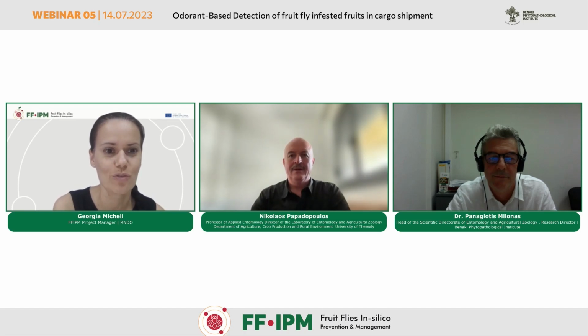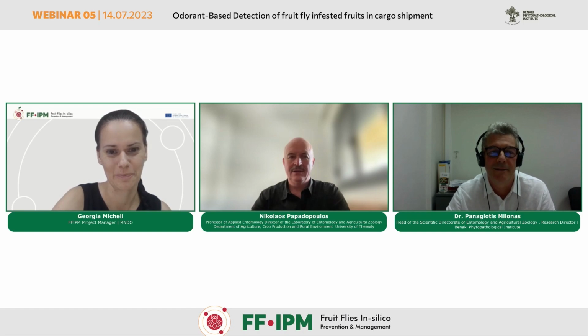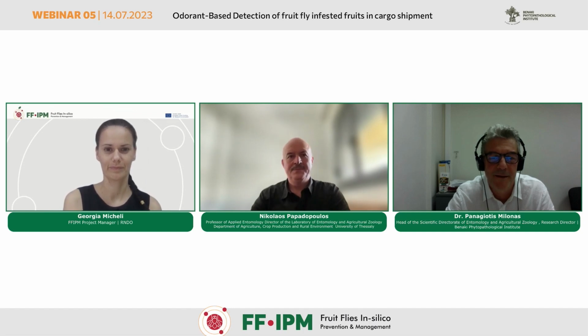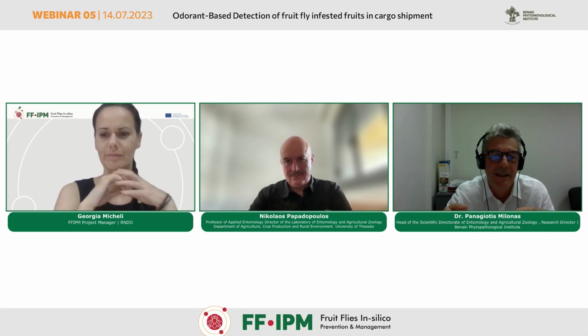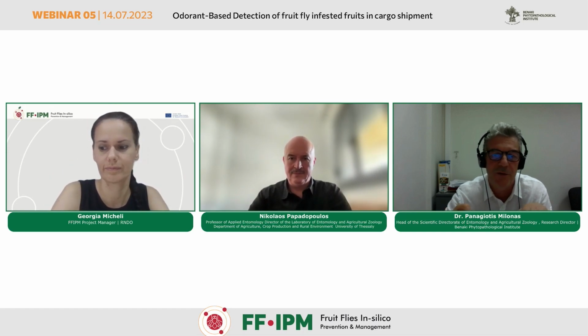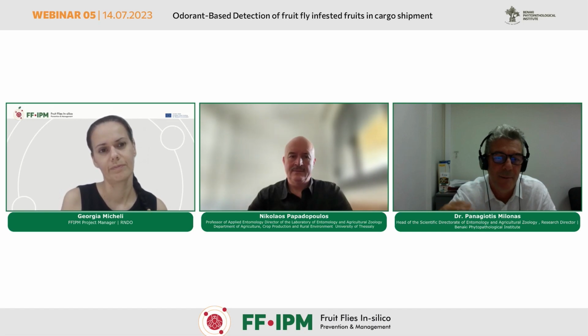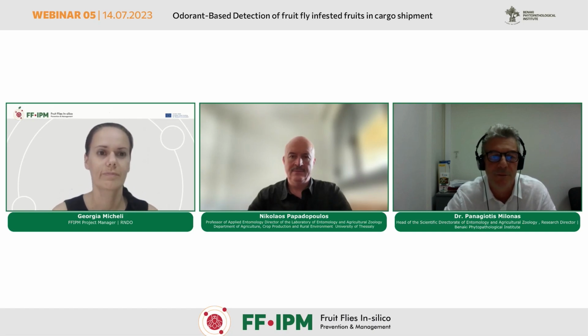Okay, and another question from Costa Zarpas. How do environmental conditions affect e-nose efficiency? Yeah, as I said about that, it's mainly the humidity that affects the efficiency. Generally, they're quite robust. If you remember the picture, they are a compact machine, very close to the environment, and it only has to take an air sample for a few seconds, and then process this sample very quickly. Of course, in every sampling, there is a procedure to clean the equipment, but again, that doesn't take long, just a couple of minutes.